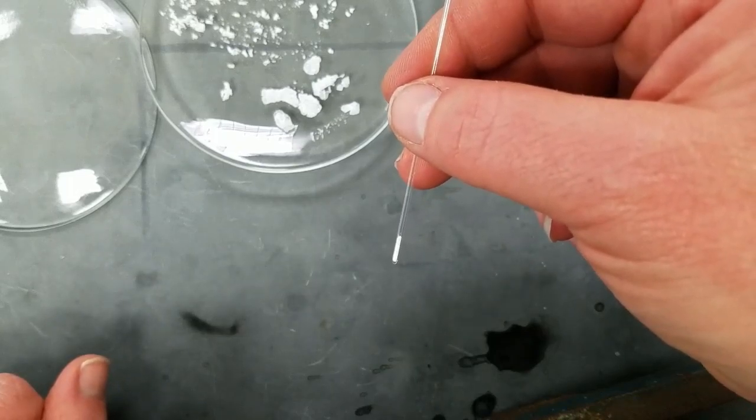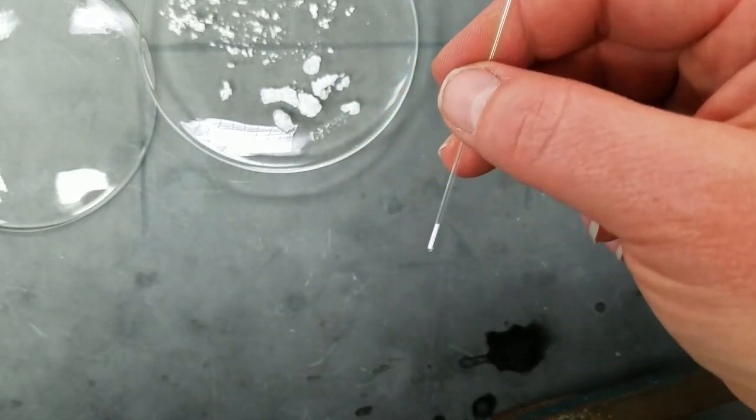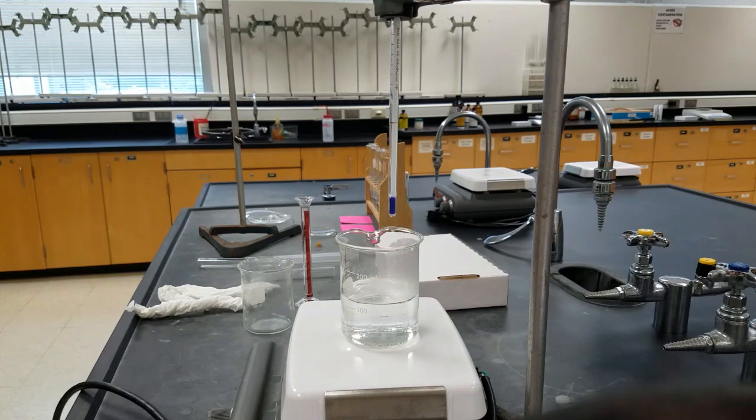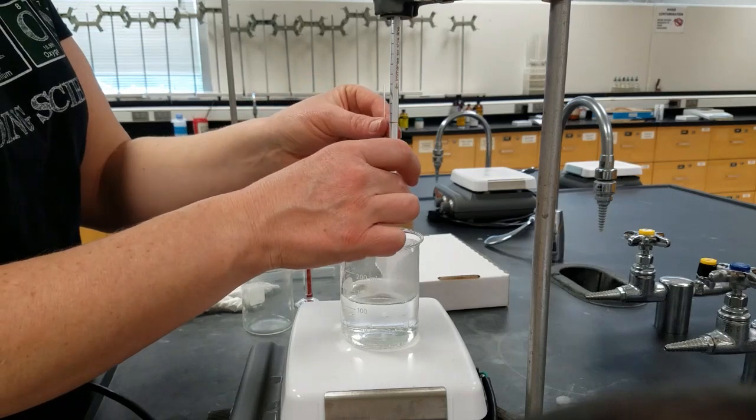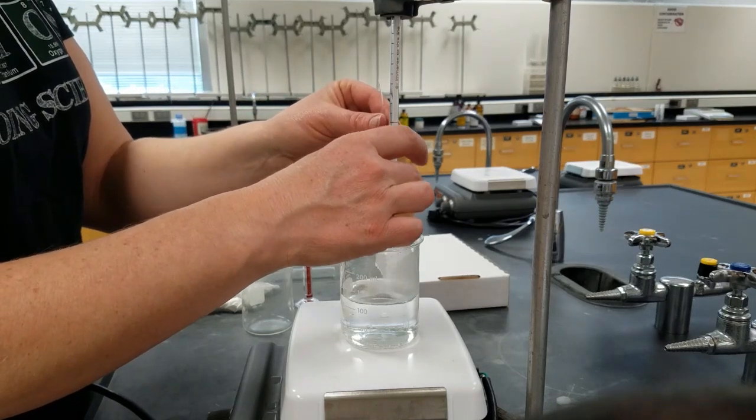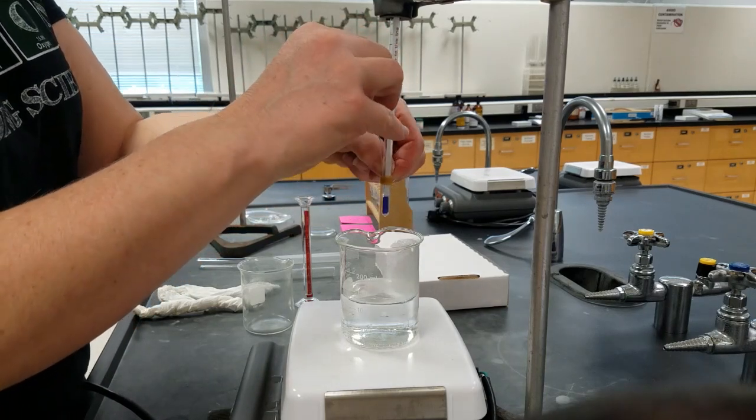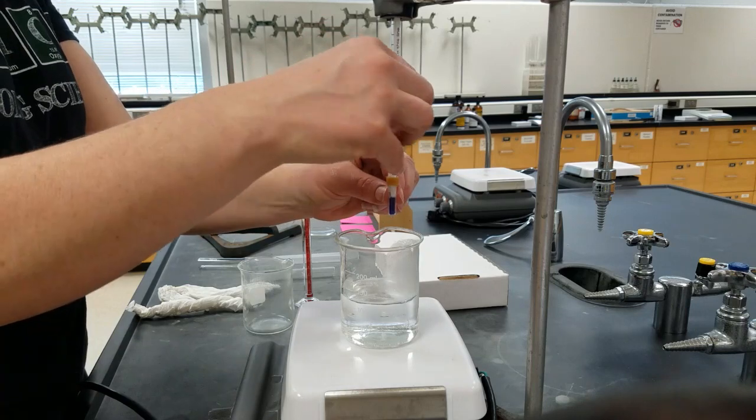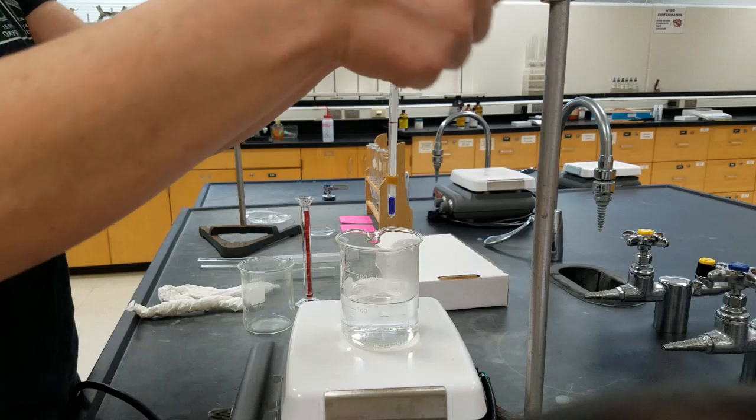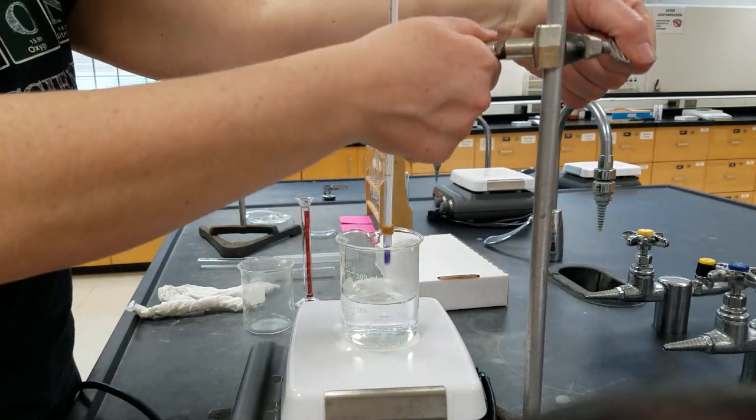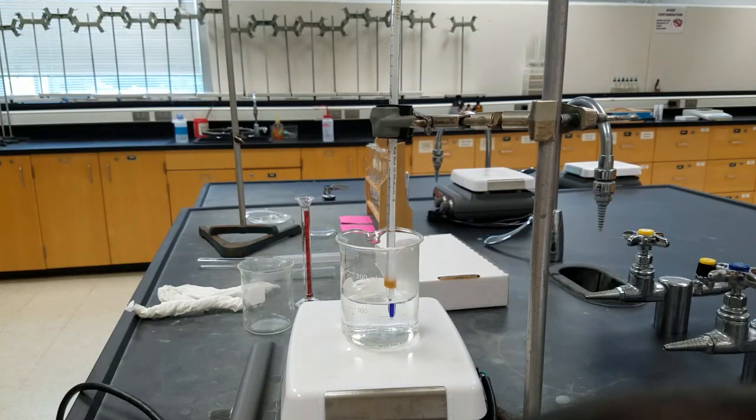We're going to use the melting point to determine the identity of our unknown solid. We take that tube that we've put our unknown solid in, use a small rubber band to attach that little capillary tube right next to our thermometer, and then we can lower our thermometer down into the water and wait for our unknown to melt.